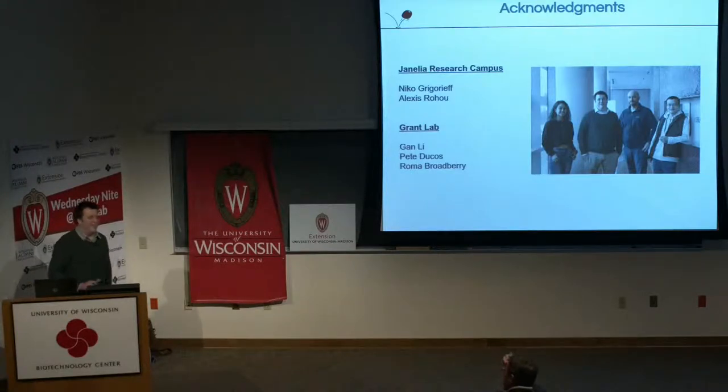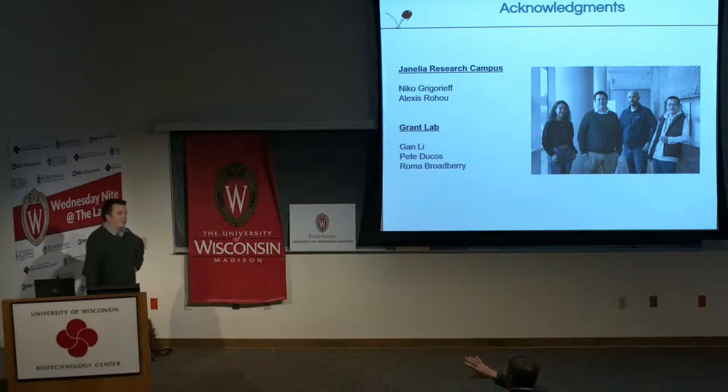Jim. In the earlier part of your talk, we were talking about the X and Y drift that happens during data collection. How regular is that for a certain sample? Like, does sample A of some protein always migrate in the same direction, or is it random in different parts of the grid? Yeah, it's random. It is not sample dependent. It is kind of sample prep dependent.